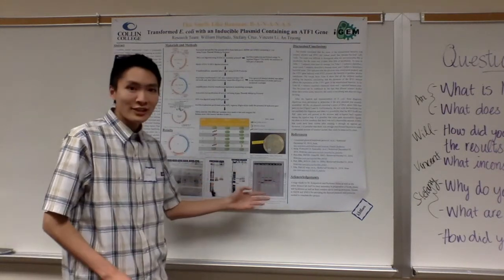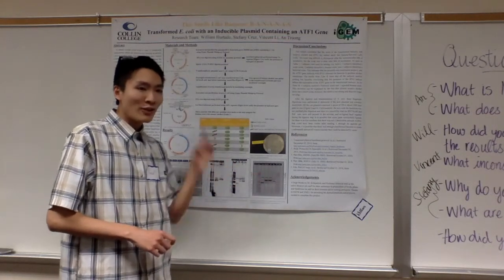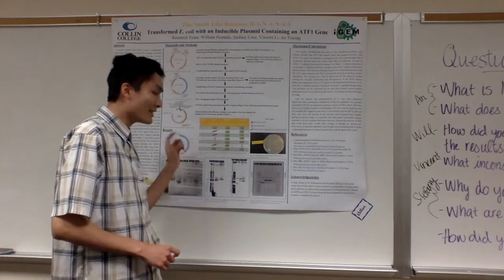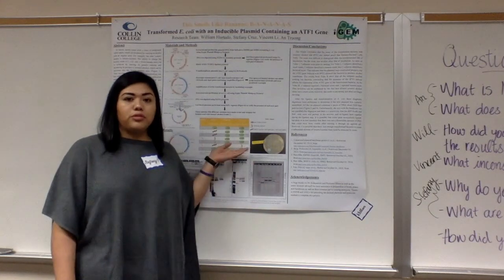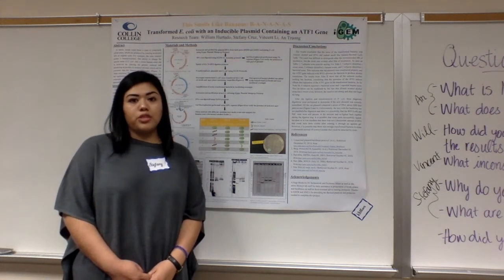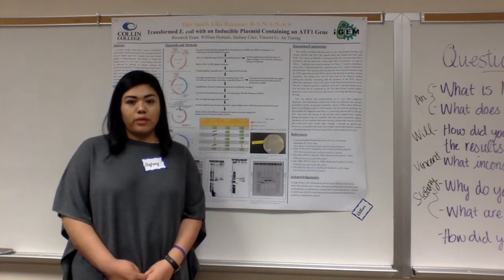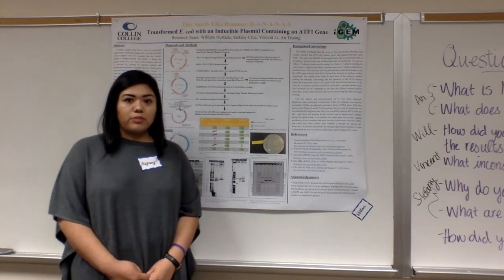Due to the results of the gel, there doesn't seem to be a detectable amount of plasmid that were actually successfully taken in. However, we could see that we had enough bacteria to produce the banana scent. We also noted that after 2 days of incubation, the banana scent was very minimal. And after 4 days of incubation, the banana smell was potent.